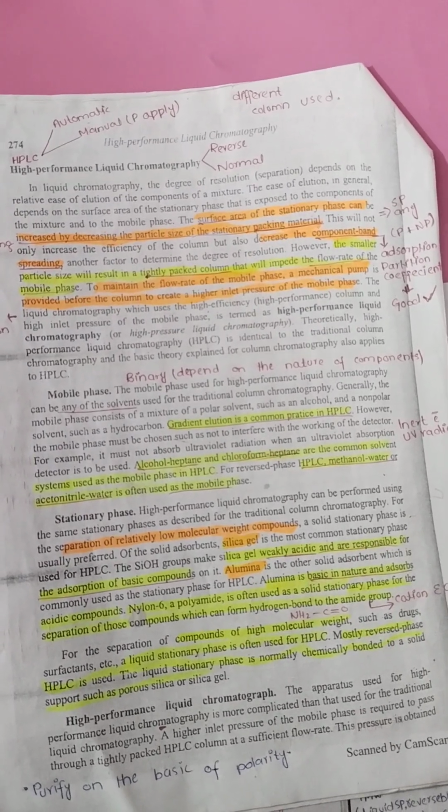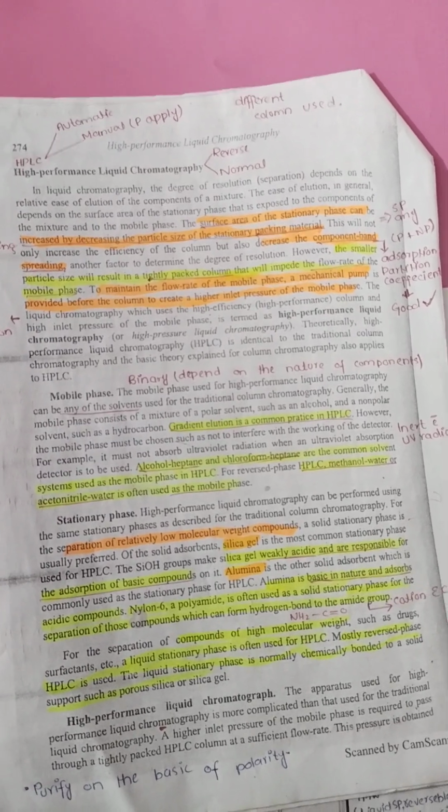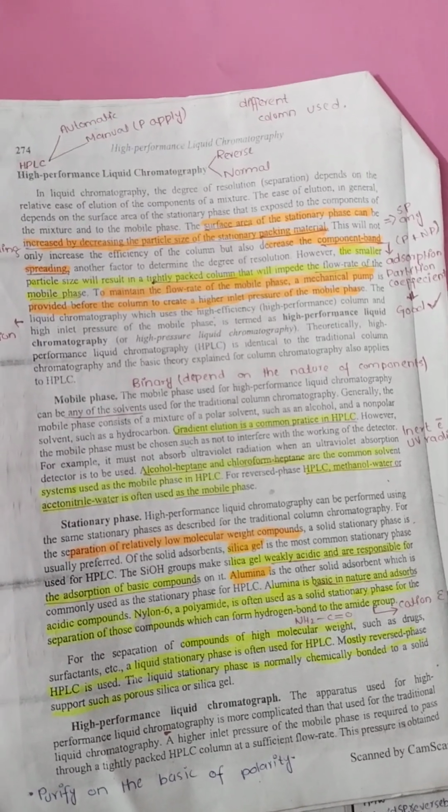To increase the ease of elution, we decrease the particle size of our stationary phase.